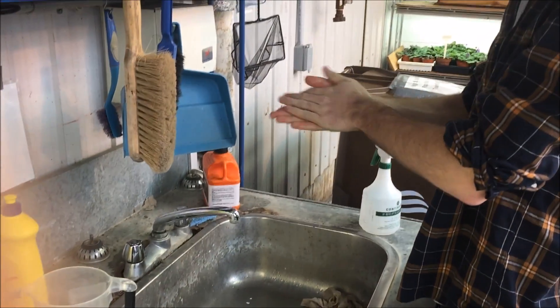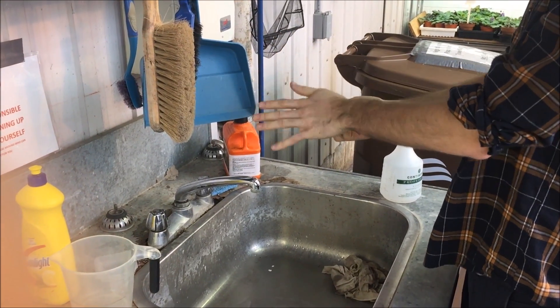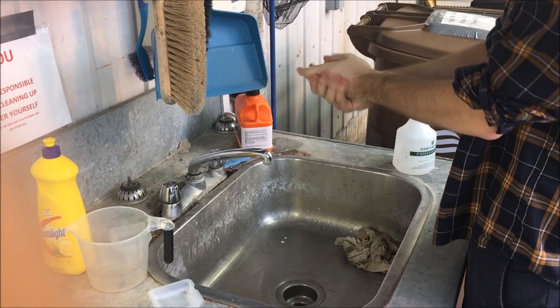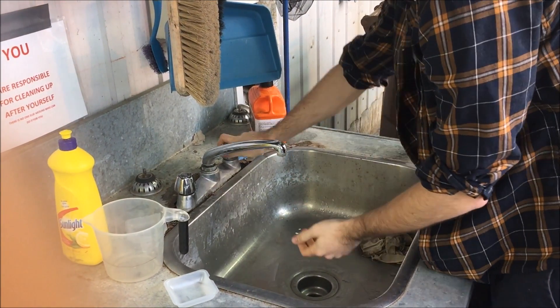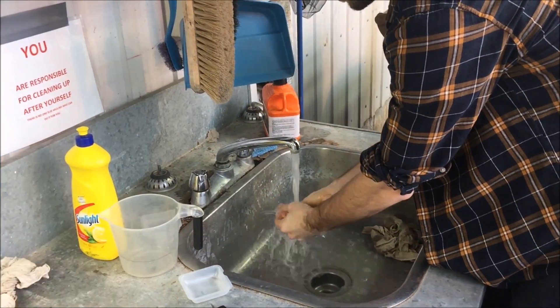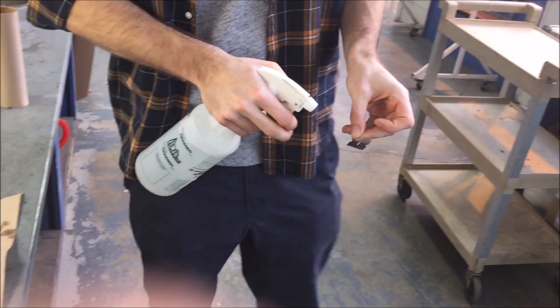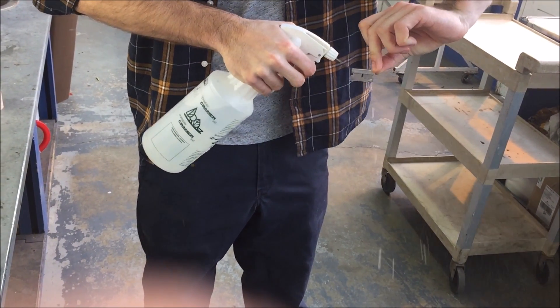Now that the plants have grown for two weeks, they are ready to be grafted. First, to avoid any contamination during the process, the propagator must wash his hands and his working area. Also, a 70% ethanol solution is sprayed on the razor blade that will be used.